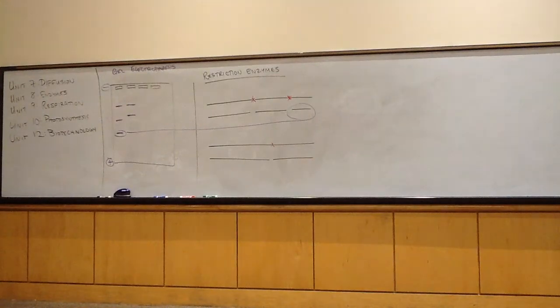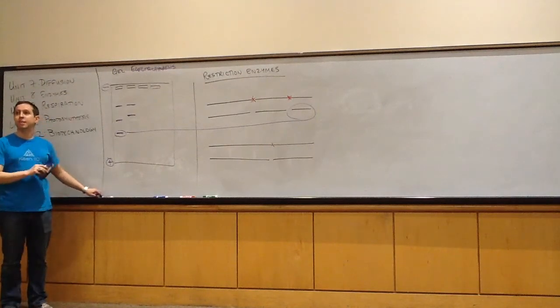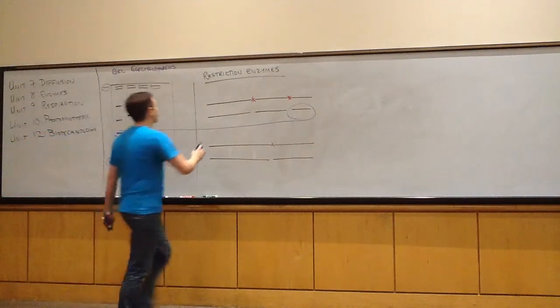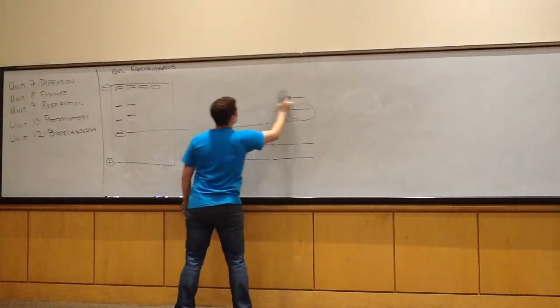Questions about gel electrophoresis? Okay, so let's talk now about the two types of analysis you do with gel electrophoresis. Let's talk crime scene, and let's talk paternity testing.